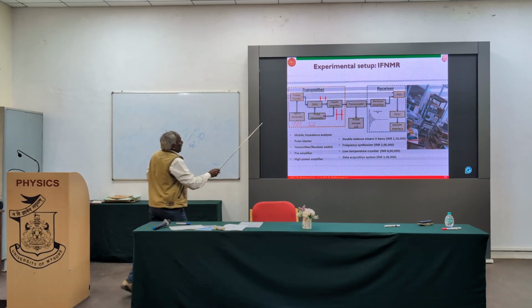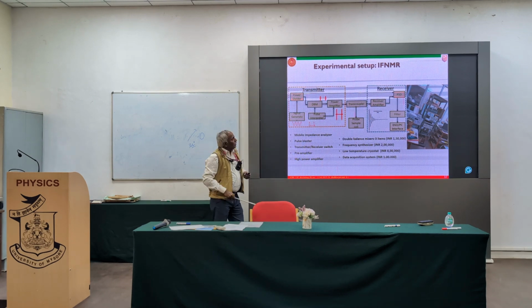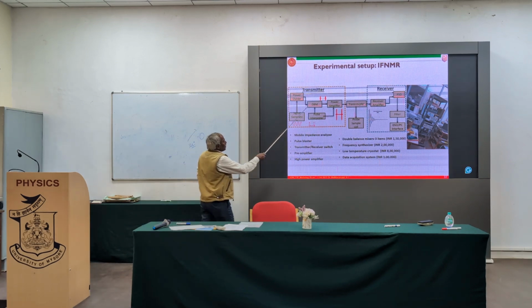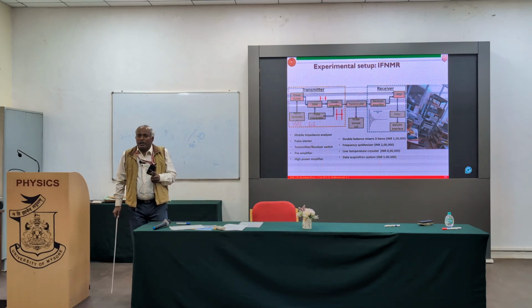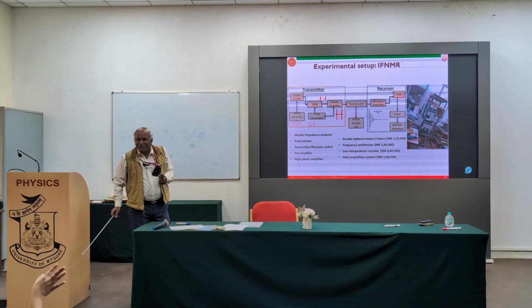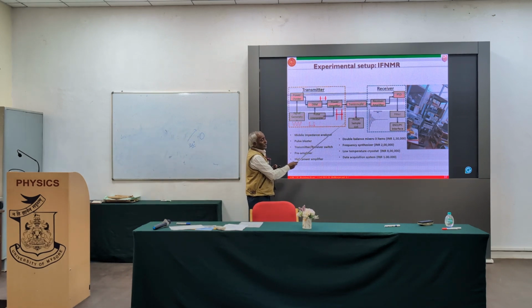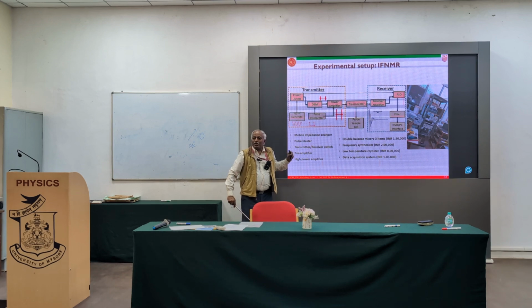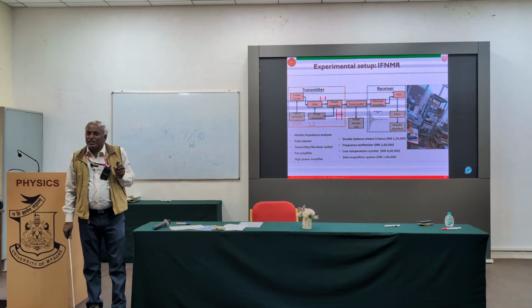Like that we measure it, and since it is an insensitive technique, it requires high power. I use a high power amplifier, a 1 kilowatt amplifier. It goes from about 2 volts peak to peak up to 200 volts peak to peak. It can be used with liquid nitrogen or helium also. Here the sample coil, especially for iron NMR, I cannot do at room temperature. The signal strength is too poor. Only cobalt I can do that. That's why, for the spectrometer we are now setting up in our university, all this work I did at IAC.